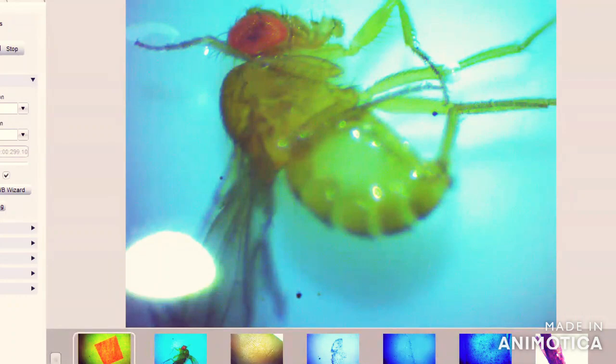These are cosmopolitan insects. They are observed in all parts of the world except Antarctica. The species is known as a lover of dew. Today we will study mainly how to differentiate male and female. Their diet is frugivorous, herbivorous. Why should we use it as a model organism? Because it has a very short lifespan and simple genome structure, so you can study it very easily in comparison to studying very complex creatures.